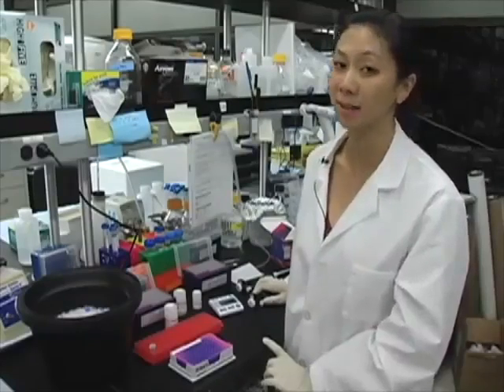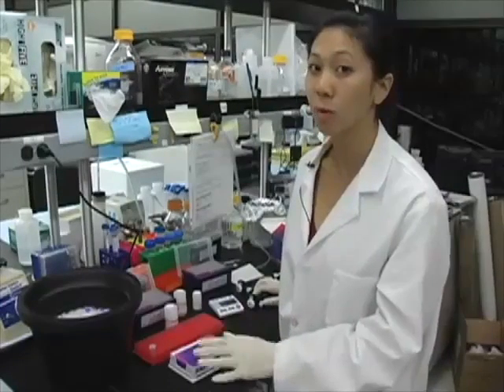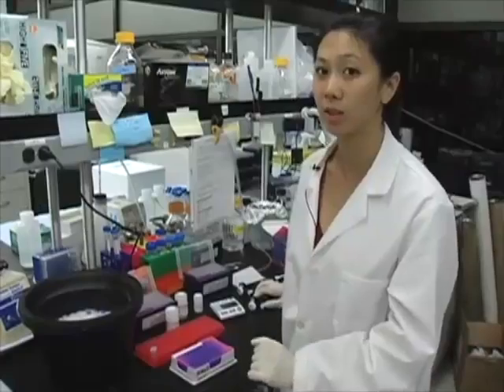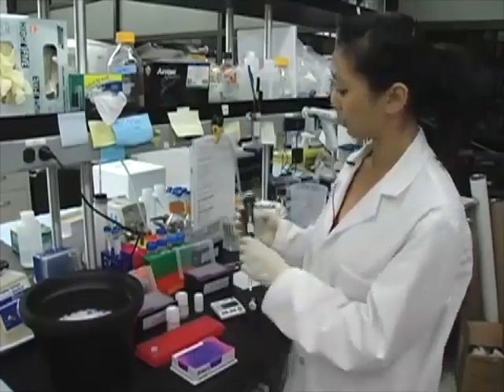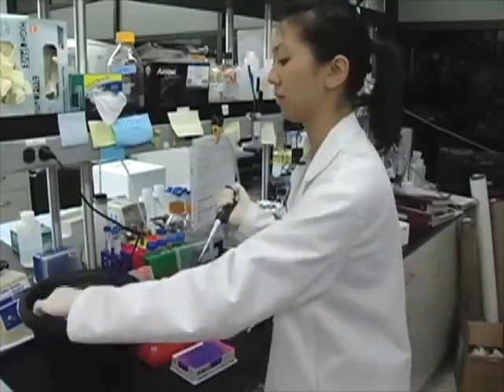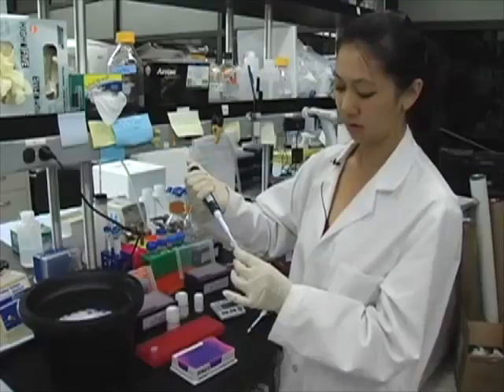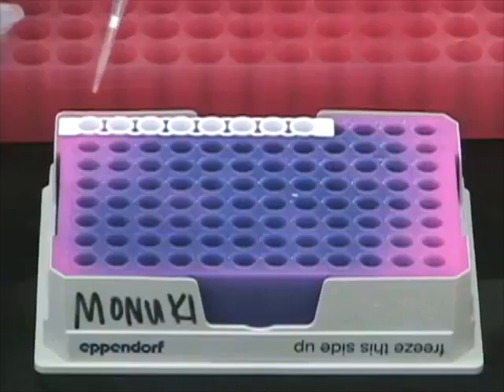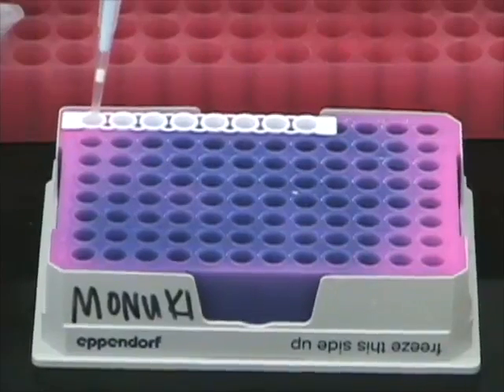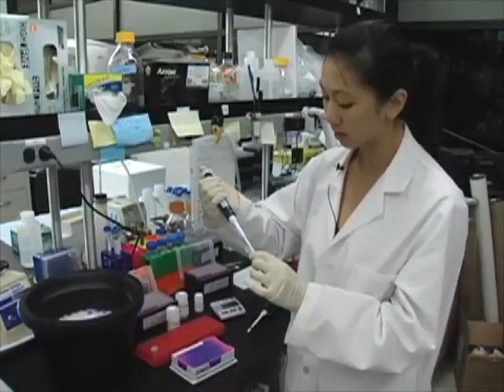All I'm going to do now is add 16 microliters of my master mix to each well, and then add 4 microliters of the neutralized extract, or 4 microliters of the positive or negative control, to each well. All I'm doing is adding 16 microliters of the master mix to each of the wells.